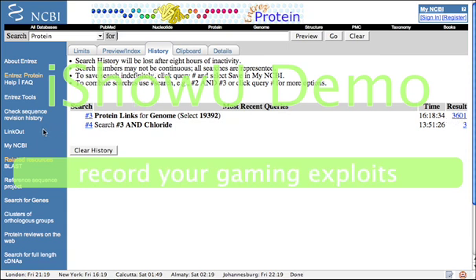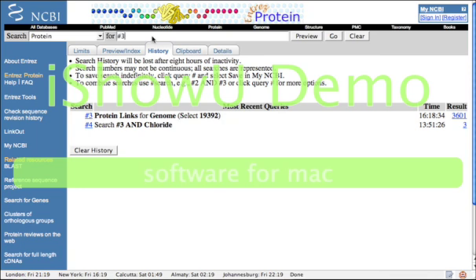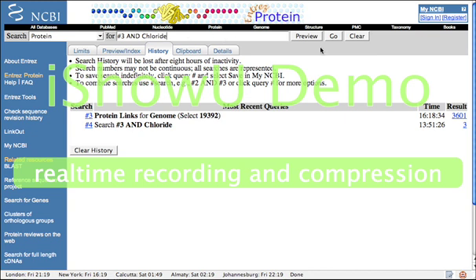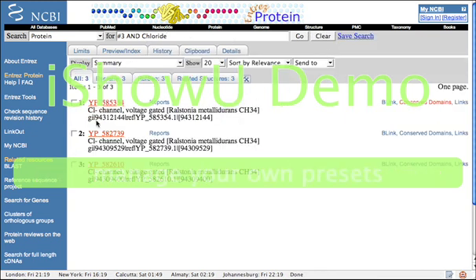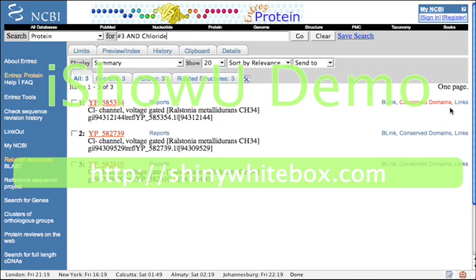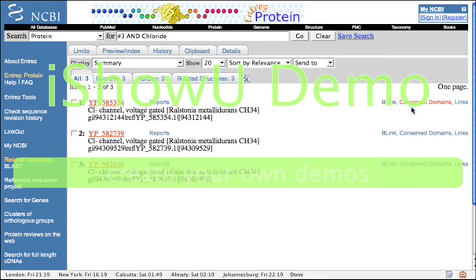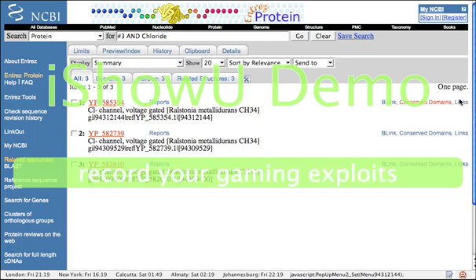We want a combination of search number 3 and an additional keyword, done very easily by entering number 3 and 'chloride'. If we click Go, we then get a list of the three ORFs that are all chloride channels for this particular bug. Note the additional sub-links here: Blink is a detailed list of pre-compiled BLAST searches, Conserved Domains is a detailed list of conserved domains within each of these ORFs, and Links, as before, pulls up a whole bunch of sub-links.